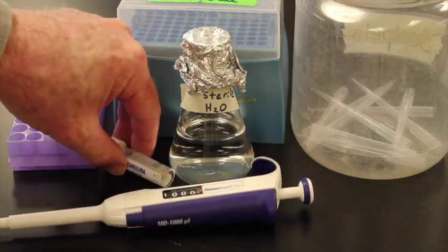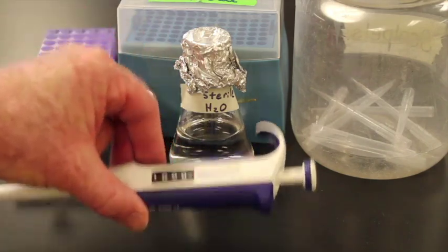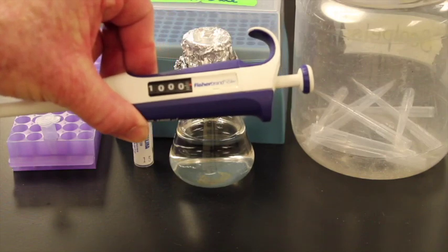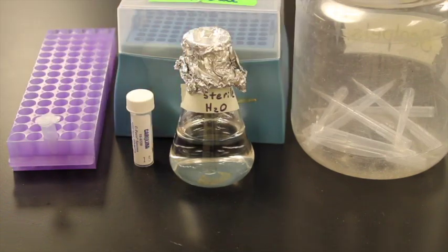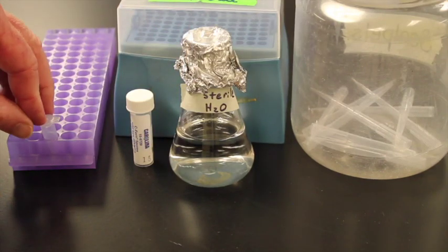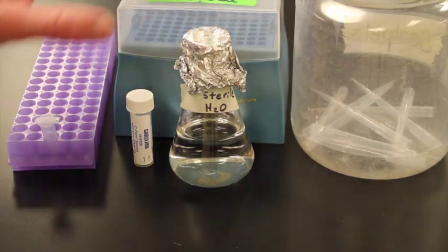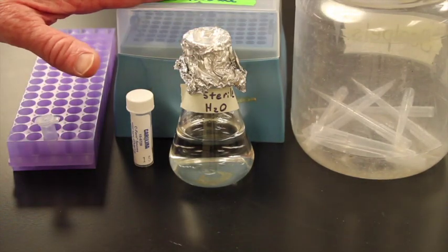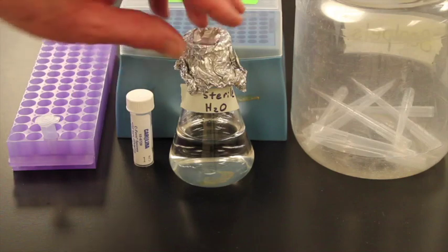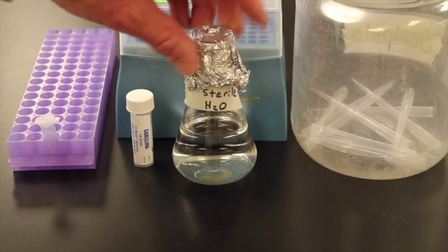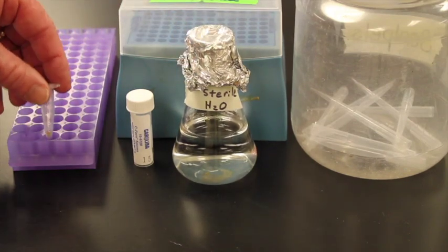So the first thing I'm going to do is take a pipetter. This is a thousand microliters or one ml. I'm going to pipette one ml into this microcentrifuge tube. Everything now has been autoclaved. I've autoclaved the tips, I've autoclaved the water to make it sterile, and I've autoclaved this microcentrifuge tube.